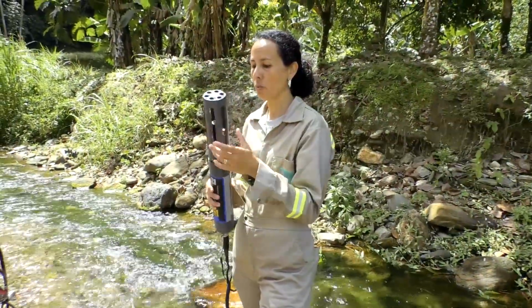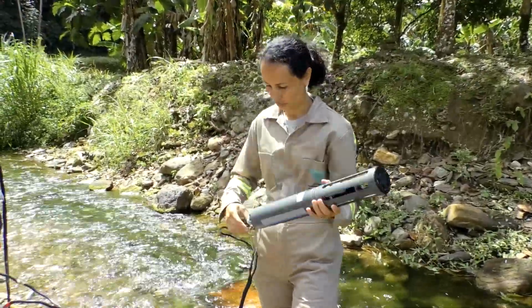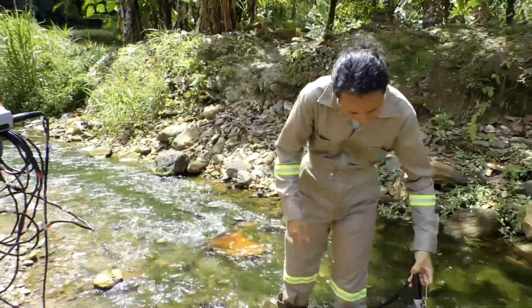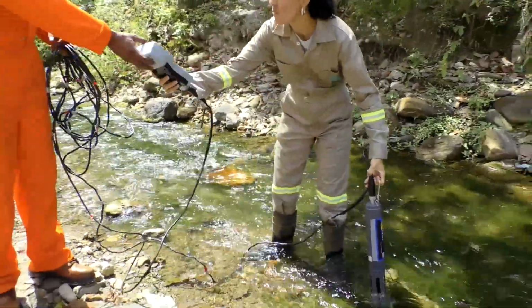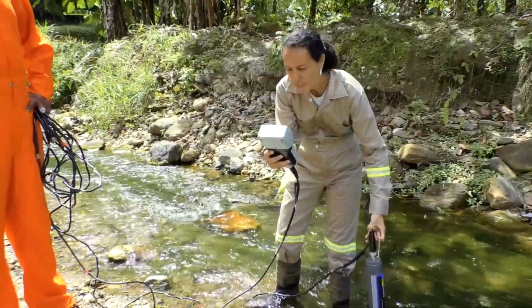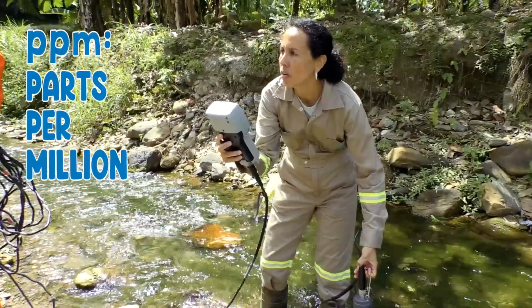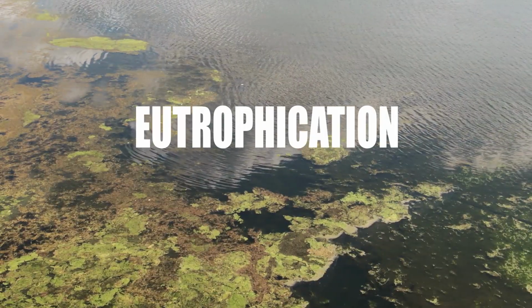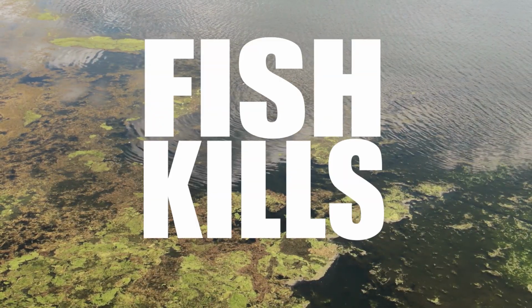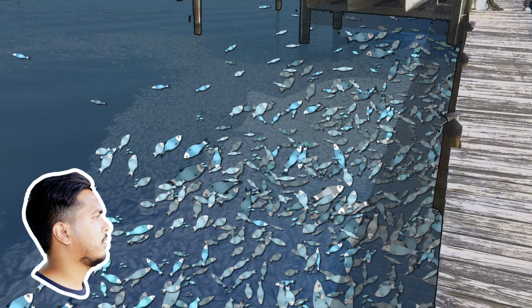For nutrients, we had to change the probes. Nitrates, 50 ppm, and phosphates, 0.4 ppm. Excess nutrients like nitrates and phosphates in your water can result in eutrophication, depleted oxygen, and fish kills. Yeah, I really haven't noticed much fish lately.